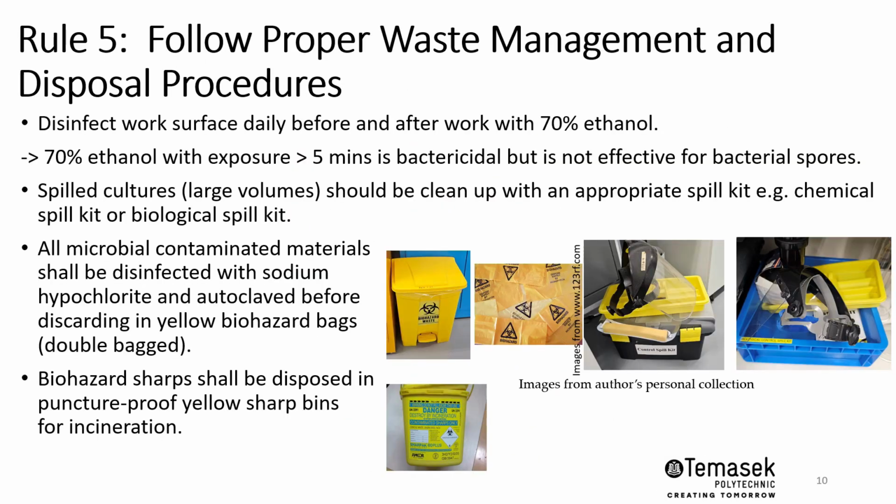As we work in the lab, inadvertently you will generate waste, so it's important to follow proper waste management and disposal procedures. Before starting work and after, do wipe down and disinfect your work benches and surfaces with 70% ethanol. 70% ethanol, with an exposure of more than 5 minutes, is bactericidal, meaning that it kills the bacteria. However, it's not effective for bacterial spores.